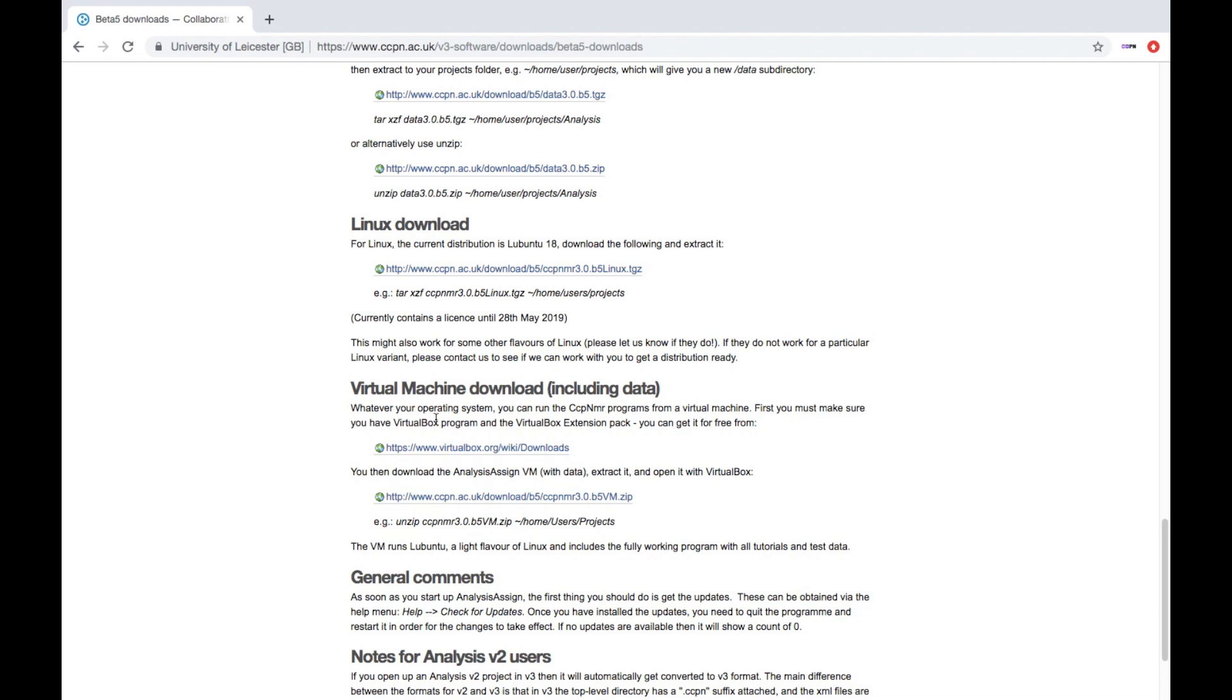But you first of all need to install the VirtualBox program, which you can get from here. And then the Analysis Assign download is here.